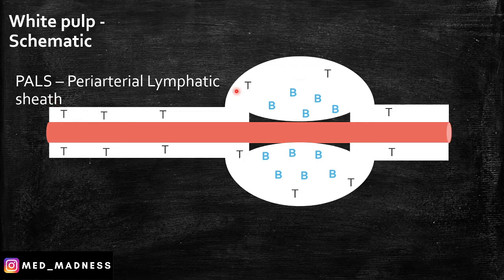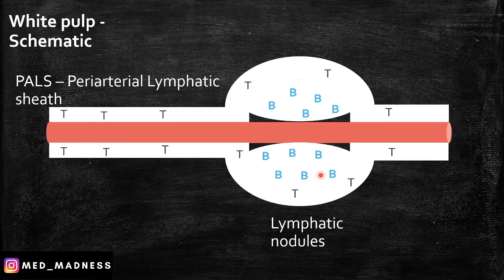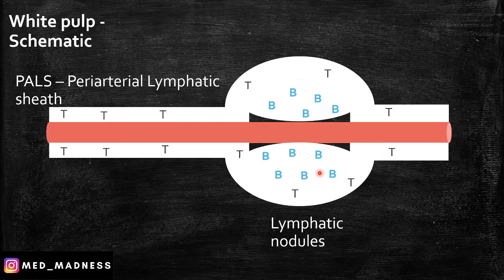And you can appreciate a nodule here — these are lymphatic nodules. In the center of the nodule, you can appreciate the B cells. Remember, lymphatic nodules are predominantly B cells and PALS is predominantly T cells. Note that these B cells are in an active state. If they become active, this area is called the germinal center.